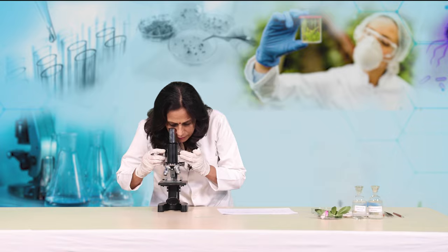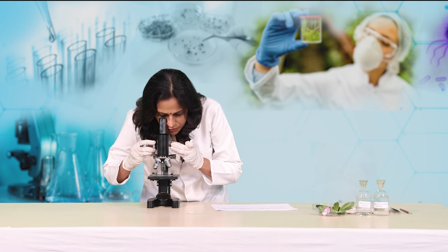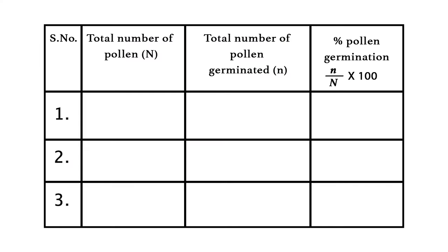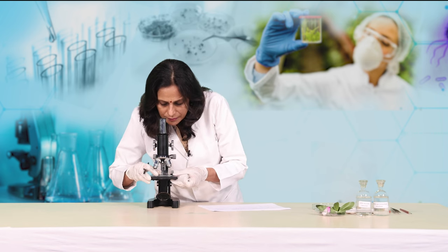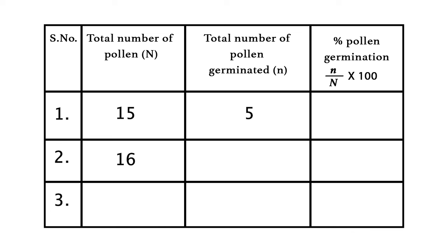I will count again. In the first microscopic field, I have seen approximately 15 total pollen grains, and out of 15, five pollen grains have germinated. This is our observation in the first microscopic field. Now we are going to take observations in different microscopic fields. Moving the slide, in the second field approximately the total number of pollen grains are 16, and out of 16, seven pollen grains have germinated.